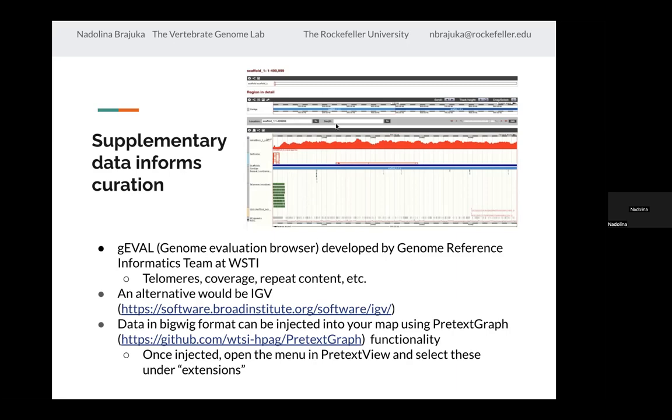It's a little bit difficult. I'm assuming it's much bigger in person, but I don't know how big it is. This is telomere repeats here. There's a number of other repeats that are shown down here. You can see the scaffolds. This is coverage. This one is really interesting. It's called self-comparison. It's basically just showing you if there are scaffolds that are interacting and which ones are interacting.